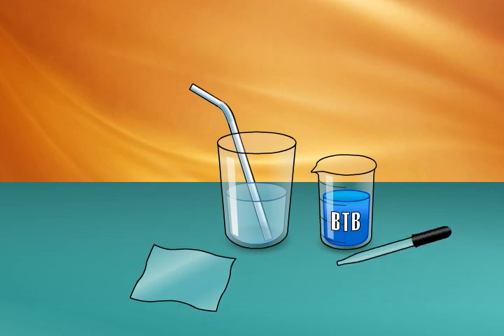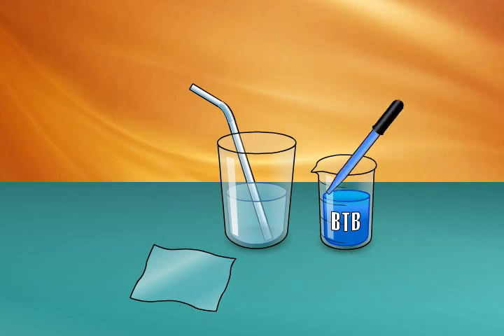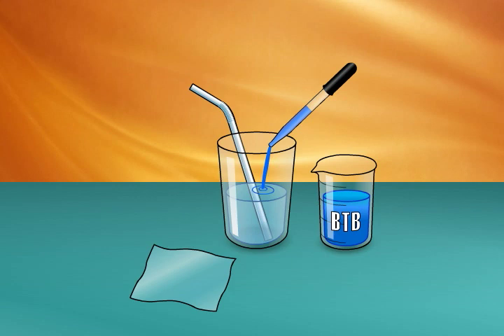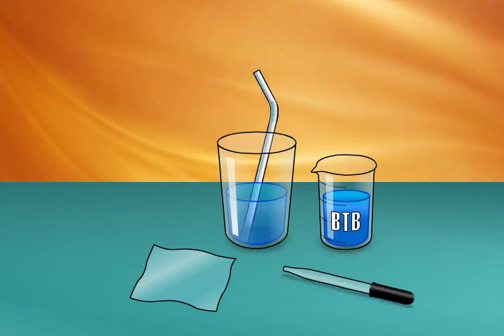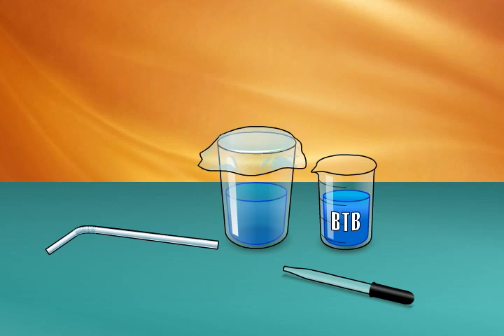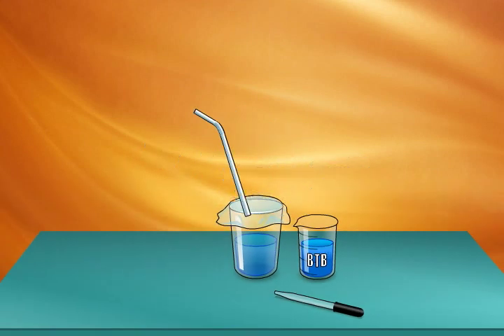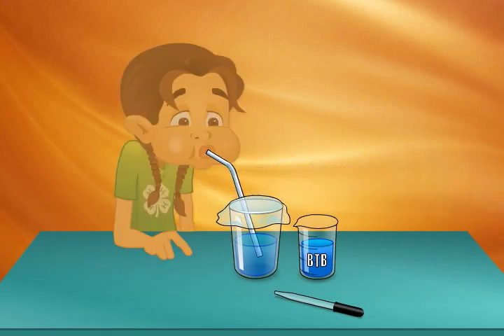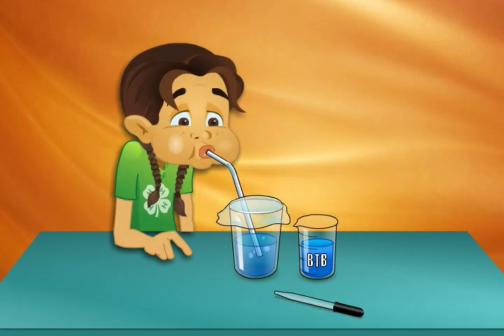First, using an eyedropper, add one dropper full of BTB solution to the first cup of water and stir with the straw. Next, using a square of plastic wrap, cover the top of the cup, insert the straw into the cup, and slowly blow bubbles.